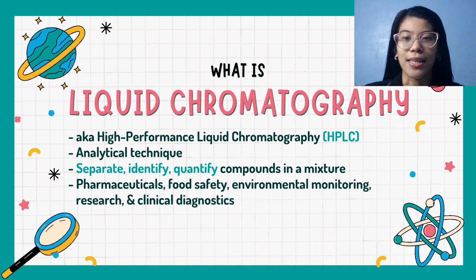It is an analytical technique used to separate, identify, and quantify compounds in a mixture. It's widely used in pharmaceuticals, food safety, environmental monitoring, research, and in clinical diagnostics.